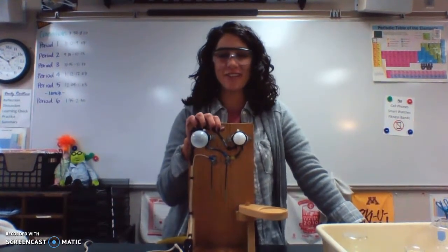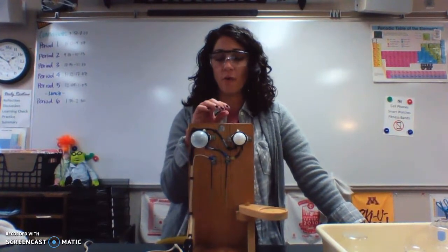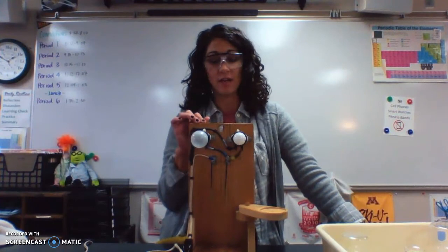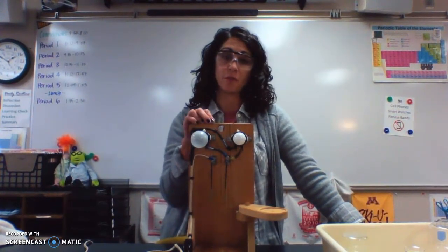This is the electrolyte experiment. I'm going to add electricity to different substances for us to then figure out if a substance is an electrolyte or a non-electrolyte. We'll also then be able to tell if an electrolyte is strong versus weak.